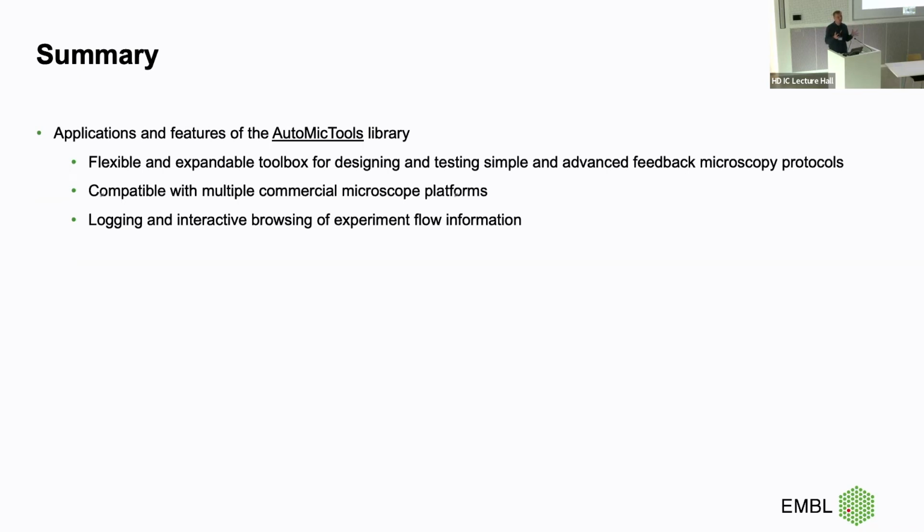We make it compatible with the different commercial vendors, which provide us the interface to communicate the commands, and we include several of these communication tools into our toolbox. And then by logging all this information, we actually know what a system does. This is the essential information for me to debug such workflows.